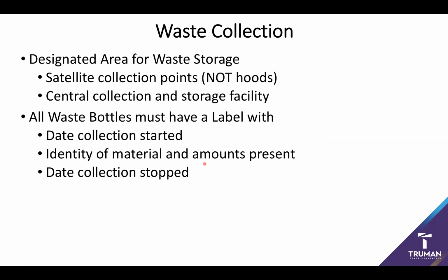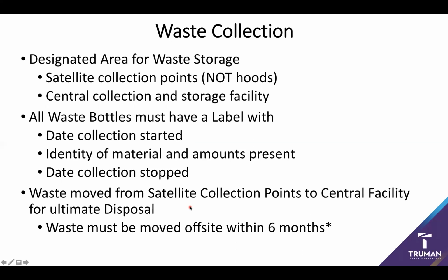Now, once you've filled a waste bottle, you have 3 days to get the waste to a satellite collection point and then quickly to the central facility. And once the bottle has been completed, so we've hit that date of collection stop, you've got 6 months to move the waste off site. If you take any longer than that, you're actually in violation of regulations. So again, make sure that all waste treatment and disposal occurs on a timely schedule.